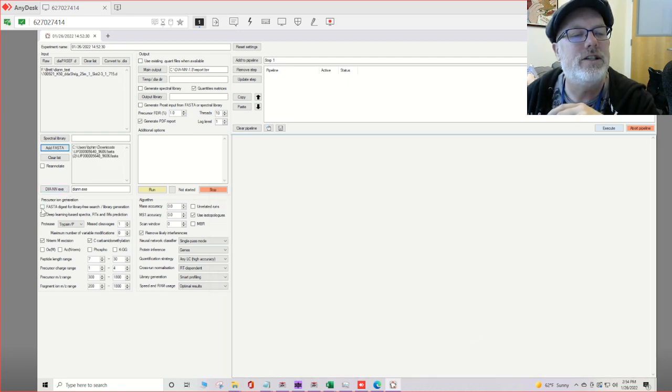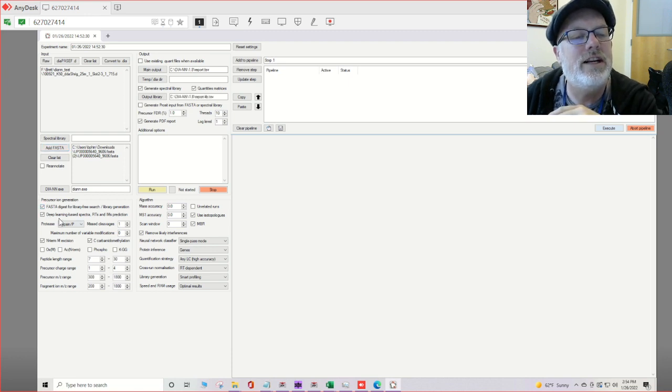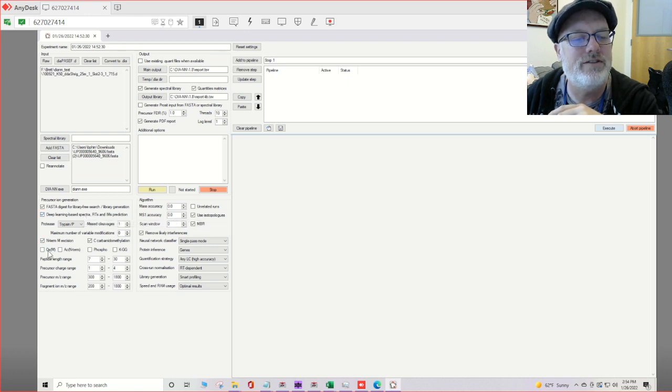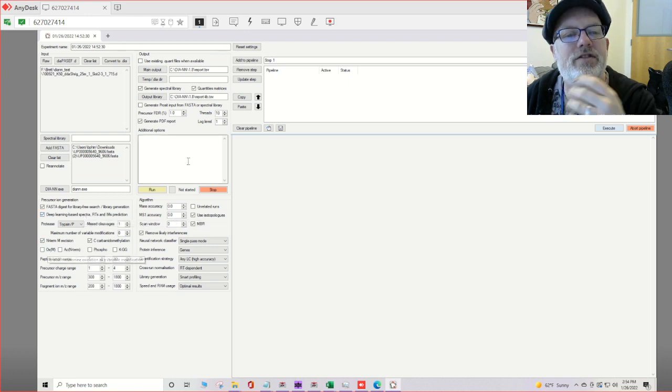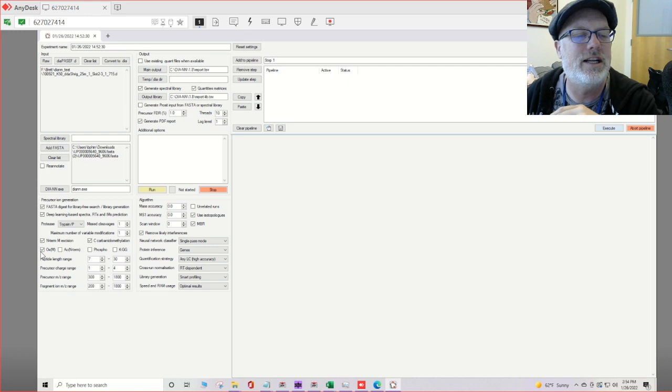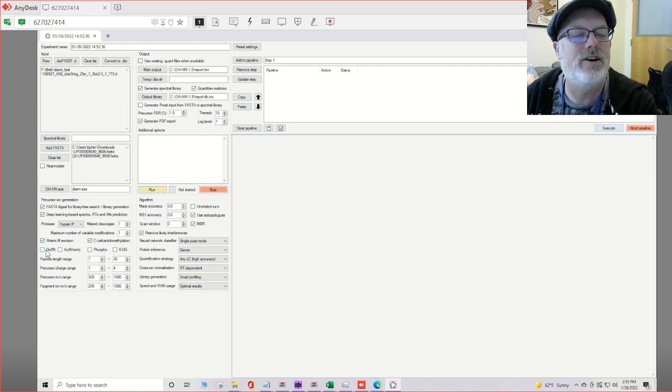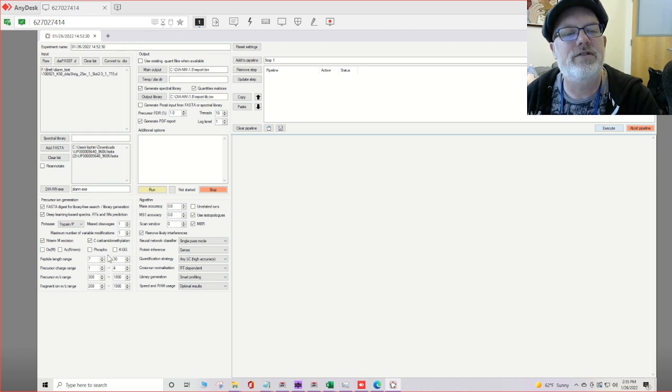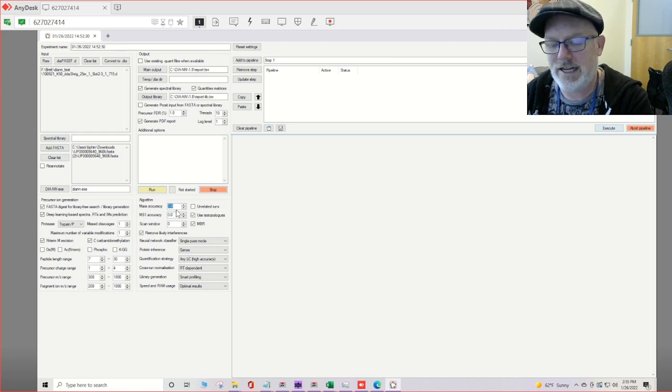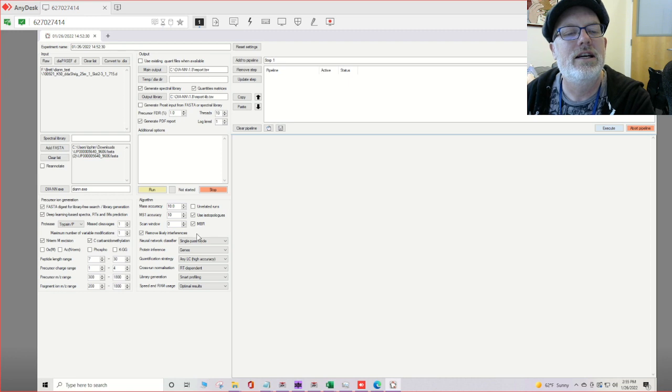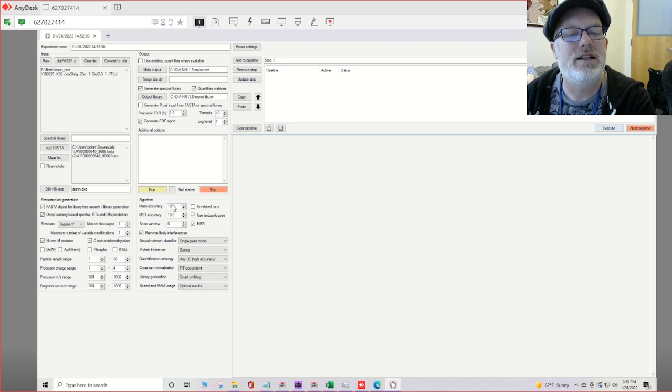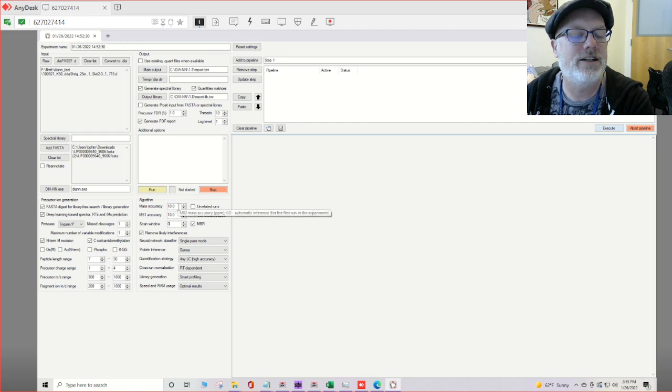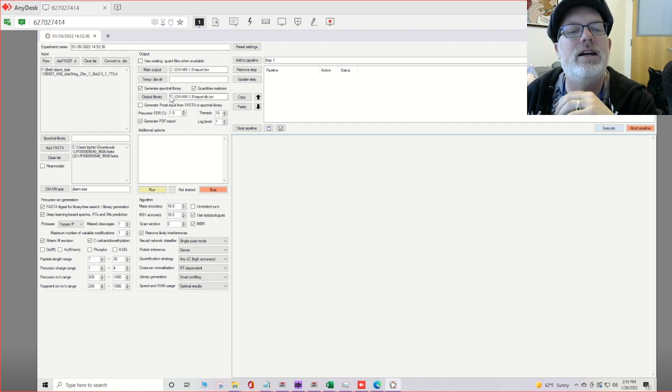You want to make sure you check FASTA digest for library free. Deep learning, we want to always turn on the deep learning. I usually leave oxidation off, although you can turn it on. I do find it gives you significantly more spectra if you do. You could try it on or off at first, but for right now let's just leave the defaults. All of the defaults will be the same except for mass accuracy. For Timstop it always likes 10. At least it gives me a prompt that 10 is better for MS and MSMS, so type in 10 here or leave it at 0.